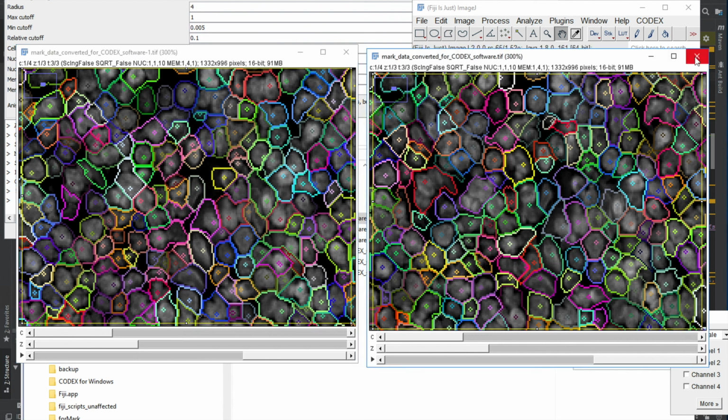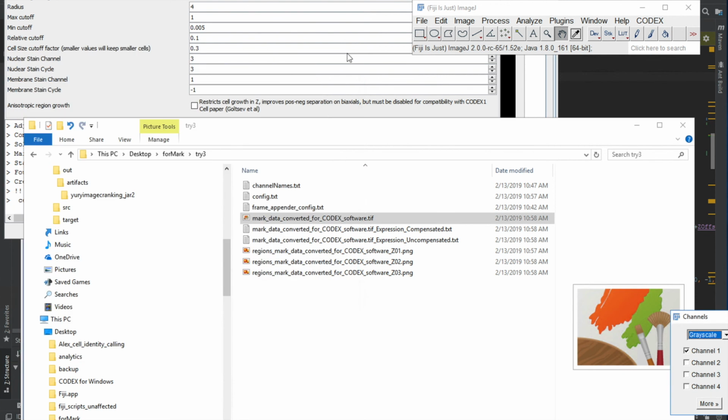Alrighty, so now you saw how to select the best combination of parameters for creating a segmentation frame and to eventually do the segmentation. That's what Codex software does. I know that there are now in development, and maybe already available, various segmentation approaches based on neural networks, but I'm not fluent with them, and that's what we're ready to provide for Mark. And if you have more questions, let me know. I'm happy to help you. Well, that's about it.